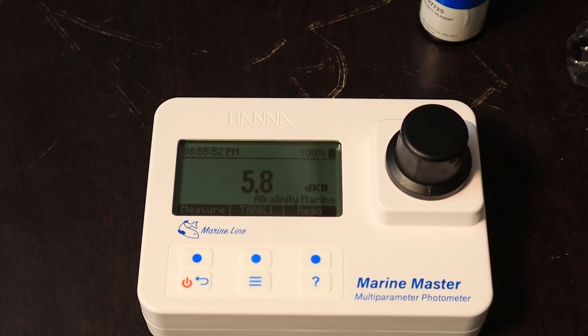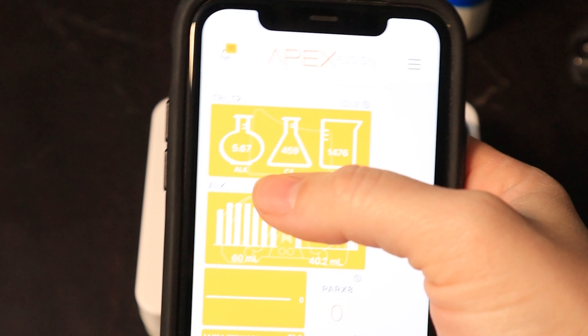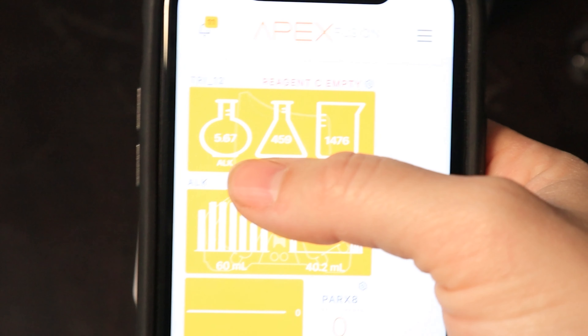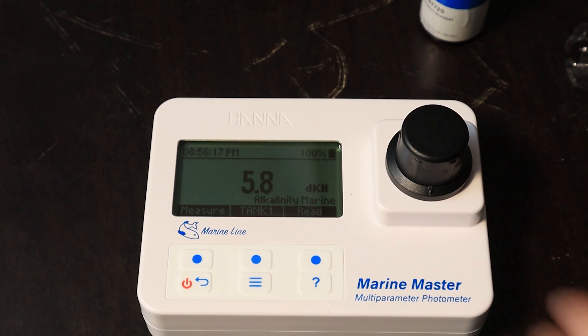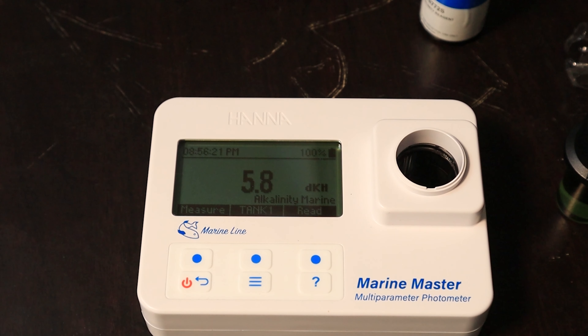Let's see what my Trident reads — grab my phone here. My Trident is actually 5.67, and I knew it was low. My calcium reactor is offline and I've been dosing slowly to bring it back up. So that is very accurate, in my opinion.